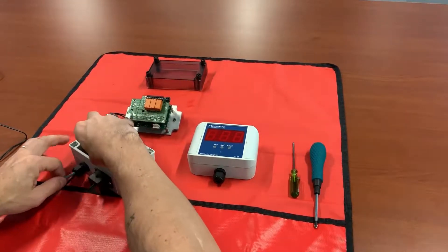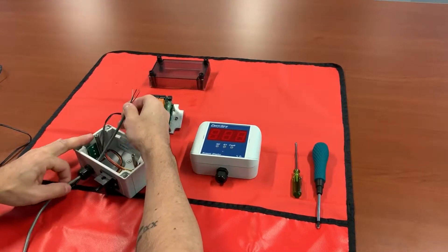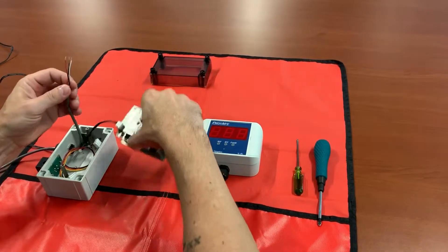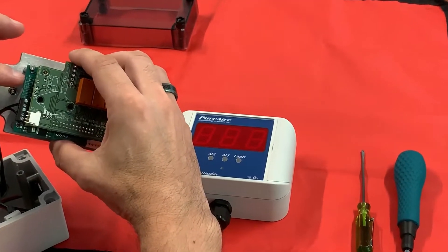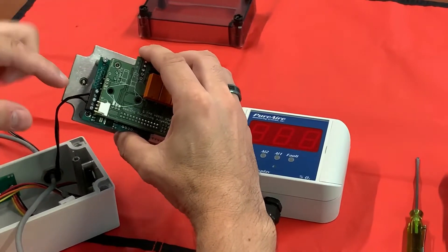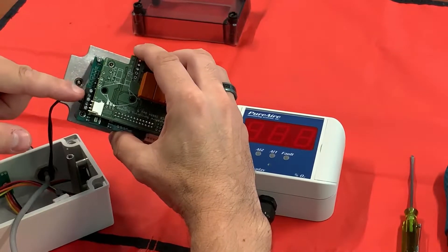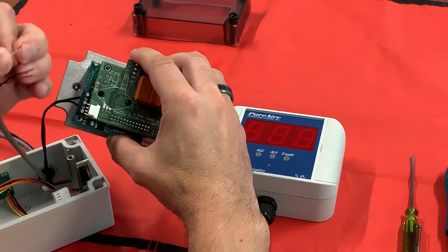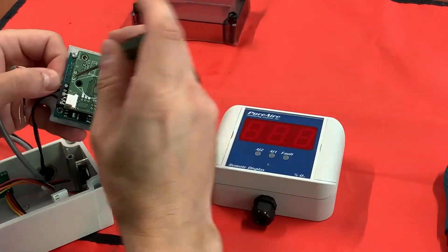You do want to use a three-conductor shielded cable. Looking at your diagram on your electronics, you have two positives, a milliamp out, and two commons. This is the terminal lug you're going to be connecting to. The top two will be your positive, so I'm going to go ahead and use my white wire as my 24-volt out and connect that up.